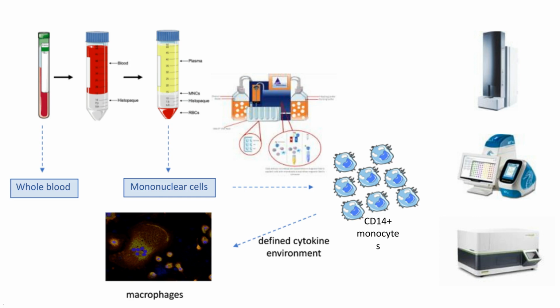And of course, the other thing we do is we take our placenta and we can mush our placenta up, we can enzymatically digest it, we can do our density centrifugation, and we can take through to our macrophages in this case, using the same CD14 microbeads that we use for the blood and the monocytes. So thinking about this journey, that's what I'm going to take you through for the remainder of the presentation this afternoon, this morning, wherever you may be in the world.